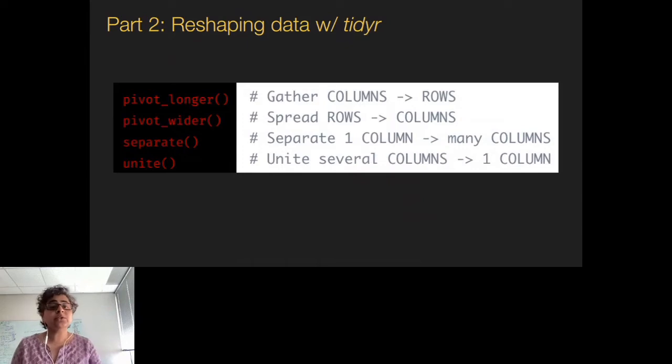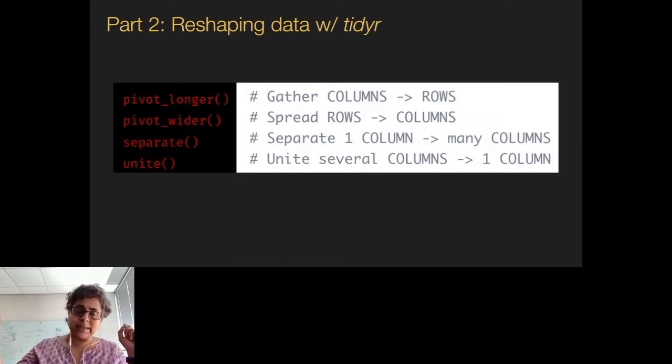Okay, I don't. So for instance, if I have year, month, date, right? So I have the 4-digit year hyphen month hyphen date in one column. Now that's great. Sometimes I might want the date if I'm plotting some continuous or categorical data. But sometimes I might want to know what the sales are for a particular year or for a particular month across years. Now, there is no way for me to get to that if I keep the date column intact. So in that case, what I might want to do is to separate it.